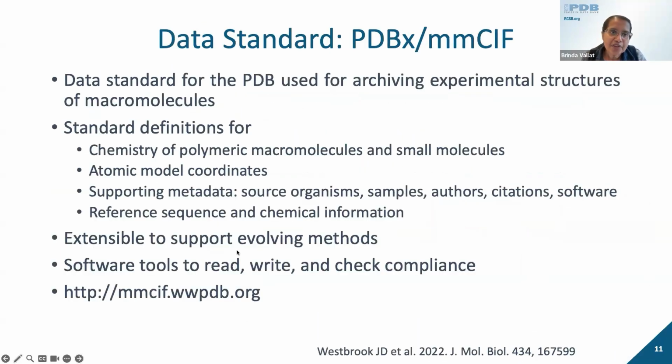So let's look at the first requirement, which is the data standard. Luckily for us, we have a strong foundation to begin with, which is the PDBx/mmCIF data standard used by the PDB to archive experimental structures. In case you're not aware of it, I encourage you to visit the mmCIF website. The link is provided here to learn more about it.